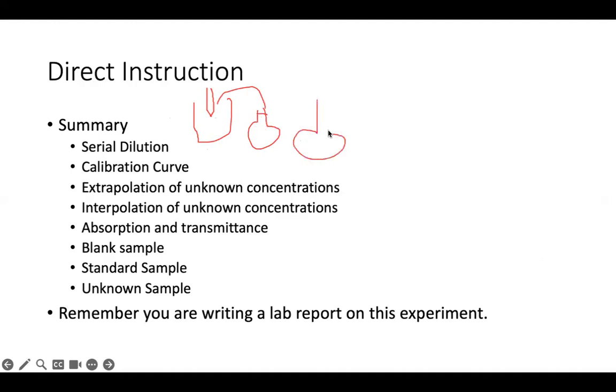For our second standard, we took from the flask beforehand, took the needed amount, and then filled it up with water. And we did that 6 times. That's so we can dilute our stock solution to get a bunch of standard solutions in different concentrations.